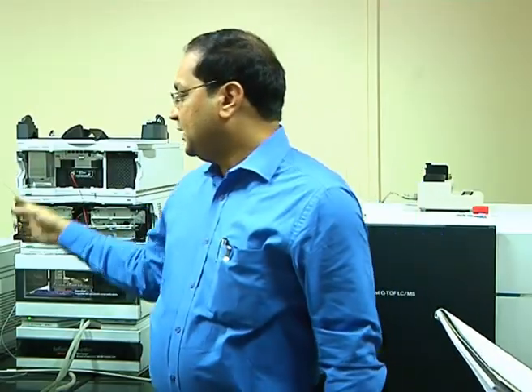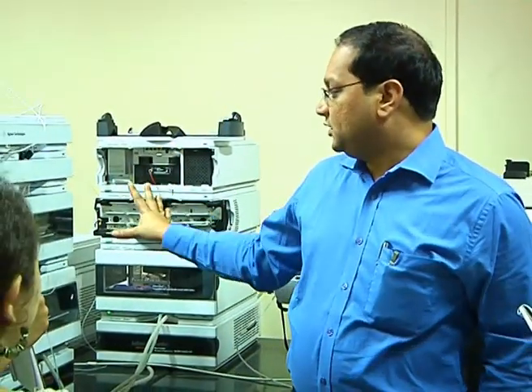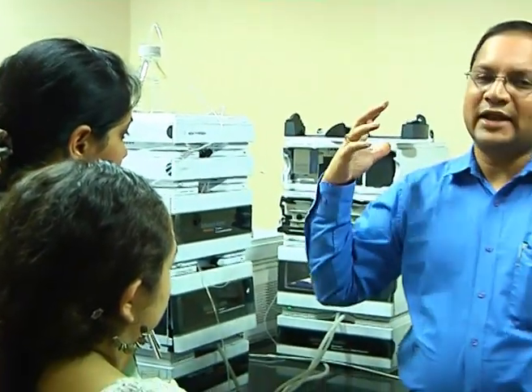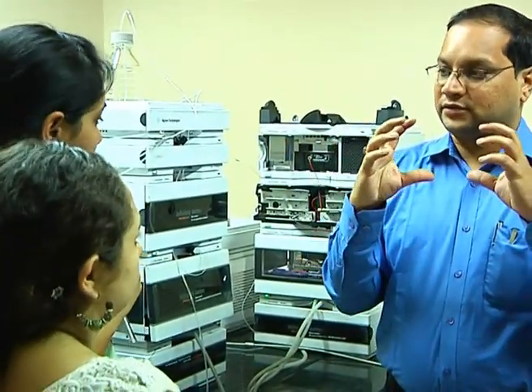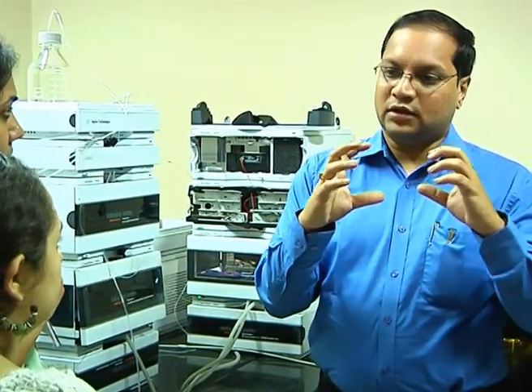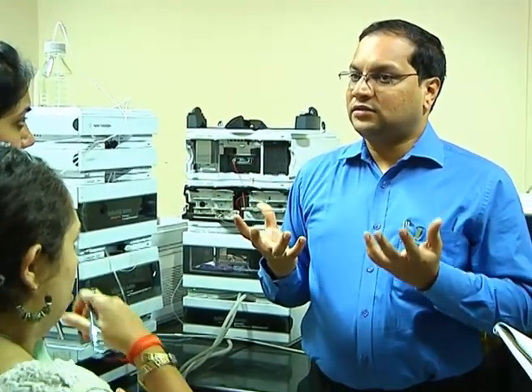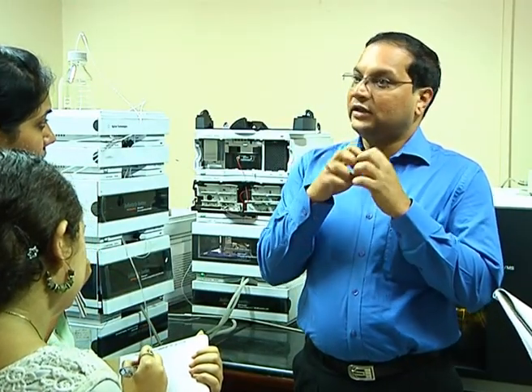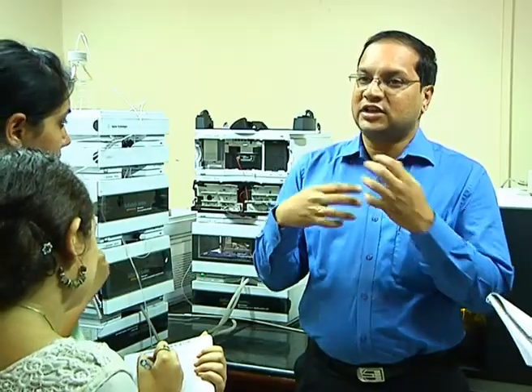As for the HPLC configuration, the basic idea is that it's a separating device. There is a module called the pump, typically a binary pump with two pumps. What is the purpose of two pumps? To pump the mobile phase. And typically what type of mobile phase do we use? In the case of peptides, it is hydrophobic interaction. Based on hydrophobicity, they will bind to the stationary phase, and then you elute by changing the polarity.